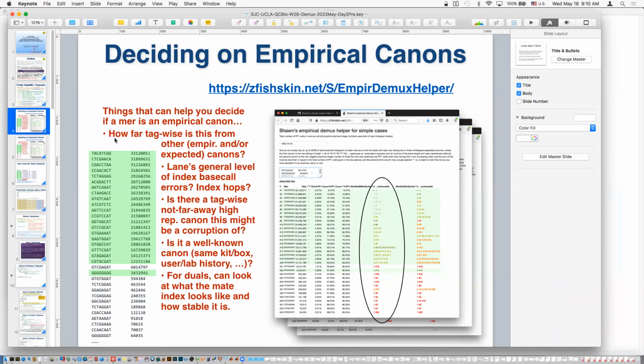Obviously, one of the primary questions is how far it is as a k-mer, as a sequence, from other things that are around, higher frequency things and so on. The empirical demux helper is the thing that helps you look at that. You give it a rank-ordered histogram and it starts comparing everybody to the guys before, or at least the green guys, you can mark and unmark guys at will, and it compares everybody to the previous green guys. And from that, you can investigate that question of how similar things are to each other.